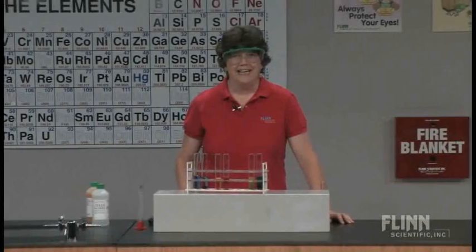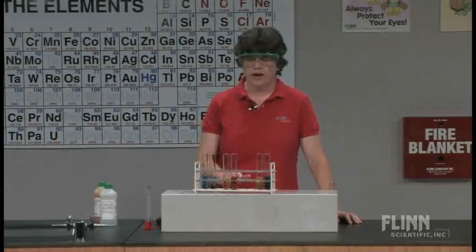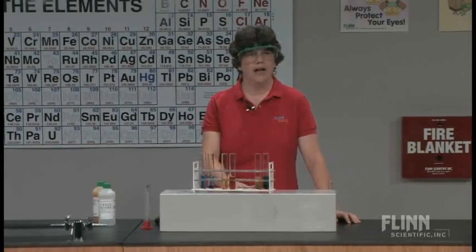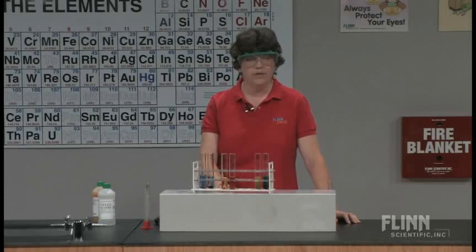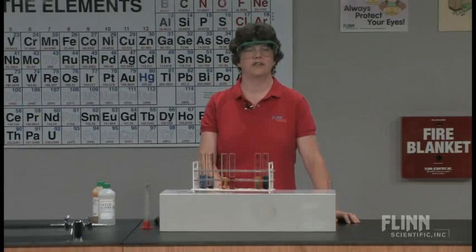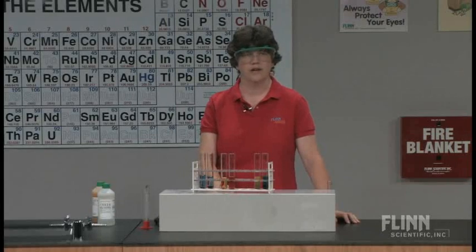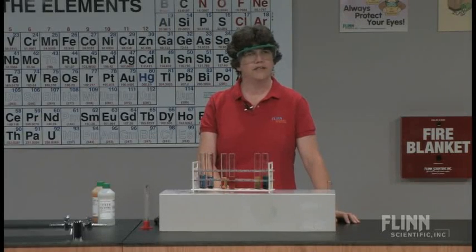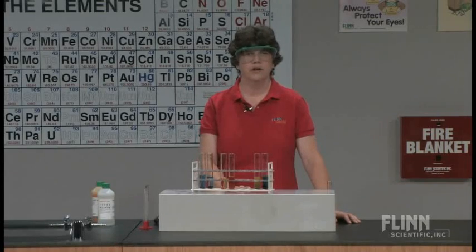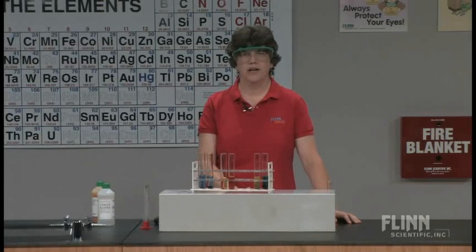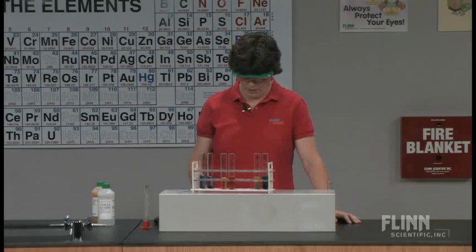Once the students have seen this demonstration and seen what the color changes of iron are, now they have a new set of colors to add to their repertoire. And they know that iron isn't just rust, that iron compounds aren't just rust. And now I can send them back to the lab. I would do this for the advanced students. I would give them an unknown solution with either the iron two plus ion or the iron three plus ion, not both.